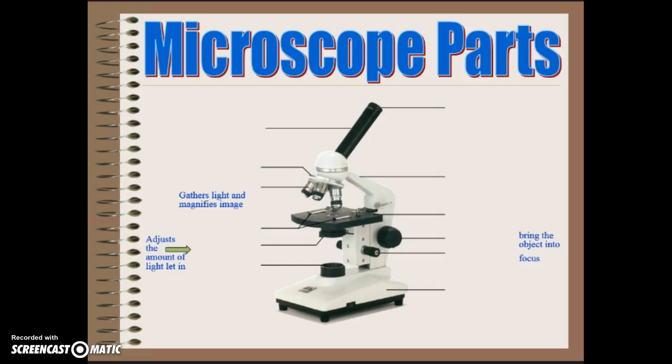You should have acquired a half sheet of paper with all of the parts of the microscope blank. You may need to cut the paper in half. You should have one as well as your partner. So get ready to fill out the different parts of the microscope on your paper.